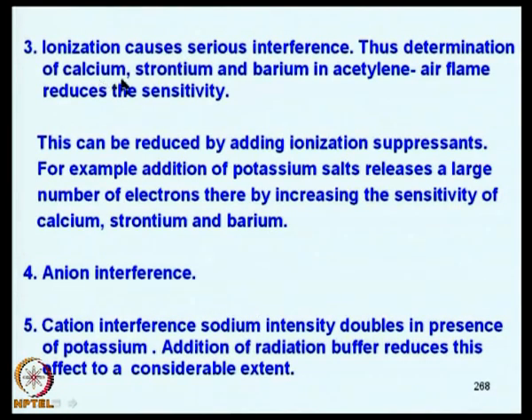Now, another possibility I must tell you is the ionization, because most of the atoms like lithium, sodium, potassium, etc., they ionize also in the flame. So, this ionization can cause serious interferences, because what we need are not the ions, but the atoms.